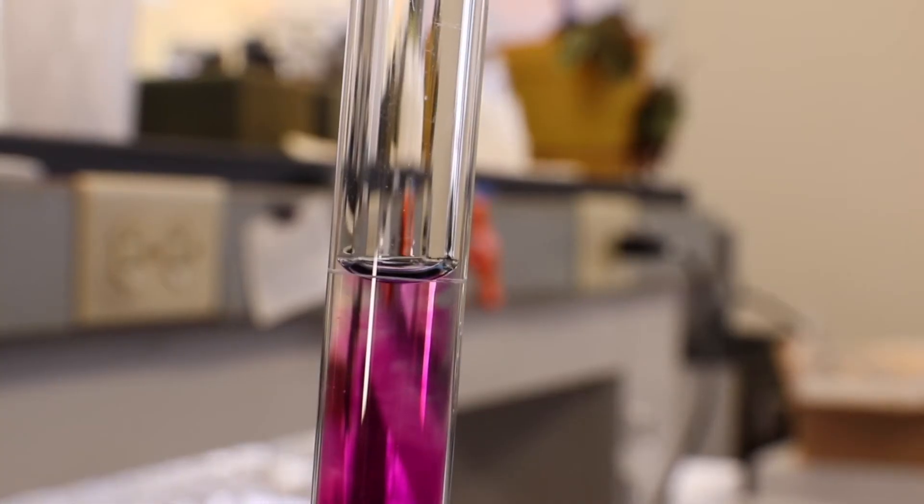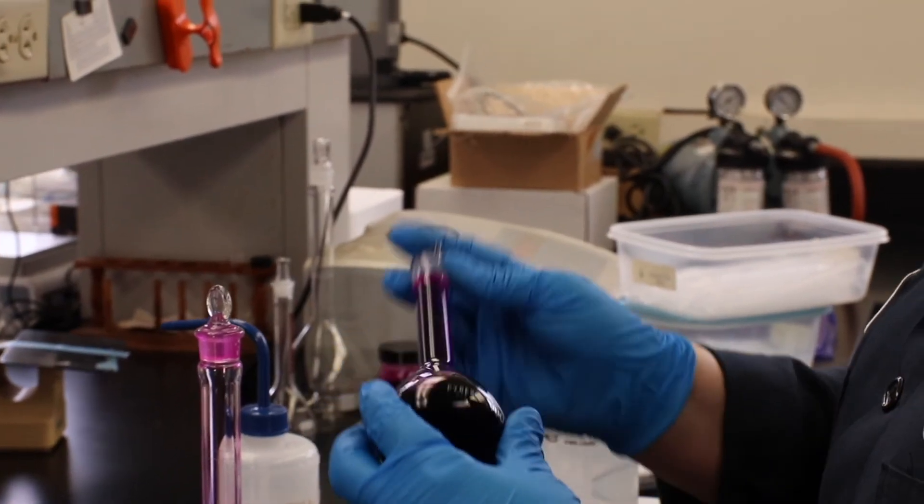Make sure that the bottom of the meniscus is at the line so that you have the correct amount of 100 milliliters in the volumetric flask. Mix well.